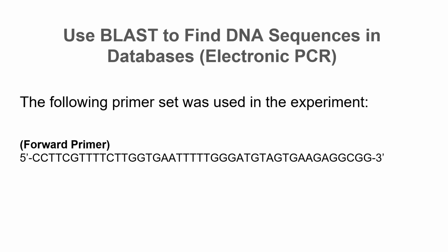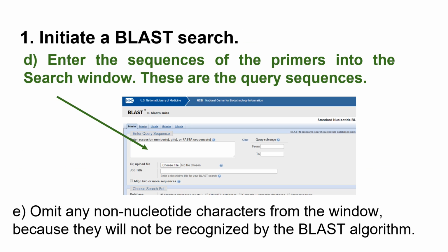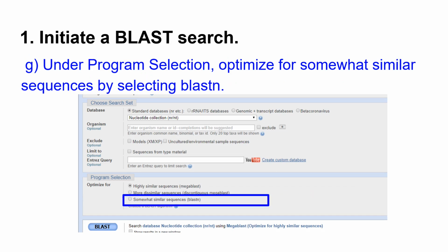Hello, in the second exercise of this lab, we are going to use BLAST again, but in this case we're going to use DNA, not protein. Here you will have a section of DNA and you have to use it to find a sequence. Again, I'm just going to walk you through very fast because it's very similar, but now you just have to go to the nucleotide section, not the protein section, and copy and paste here the DNA section that you want to get in.